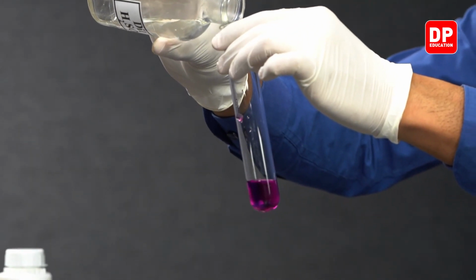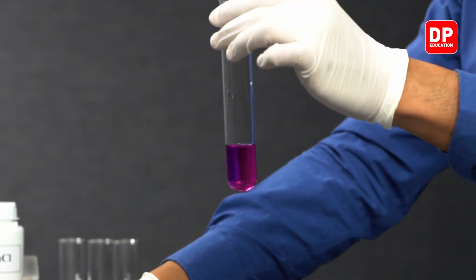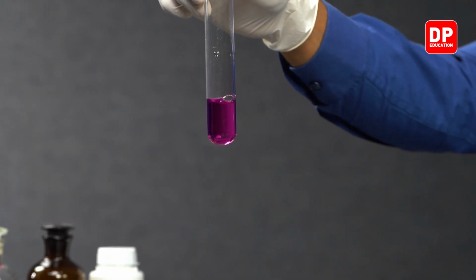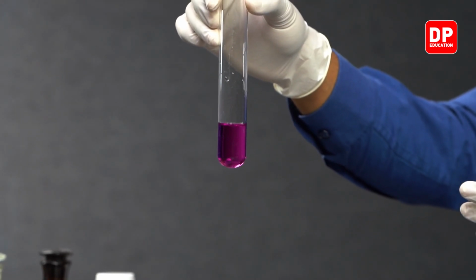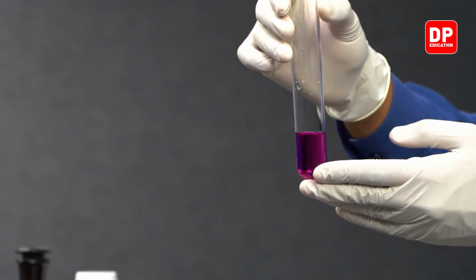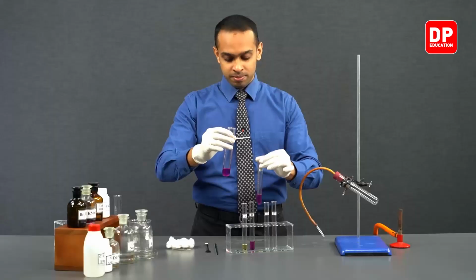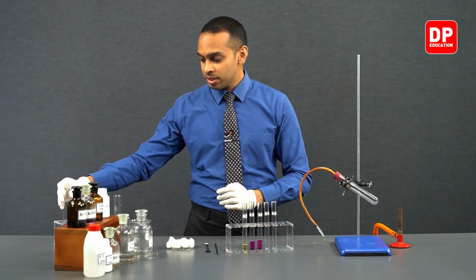So let's add a small volume of sulfuric acid. Now, after the addition of sulfuric acid into our potassium permanganate solution, we have prepared acidified potassium permanganate solution here. Let's take a small amount of this acidified potassium permanganate into our test tube labeled C. Now we can keep this boiling tube away.